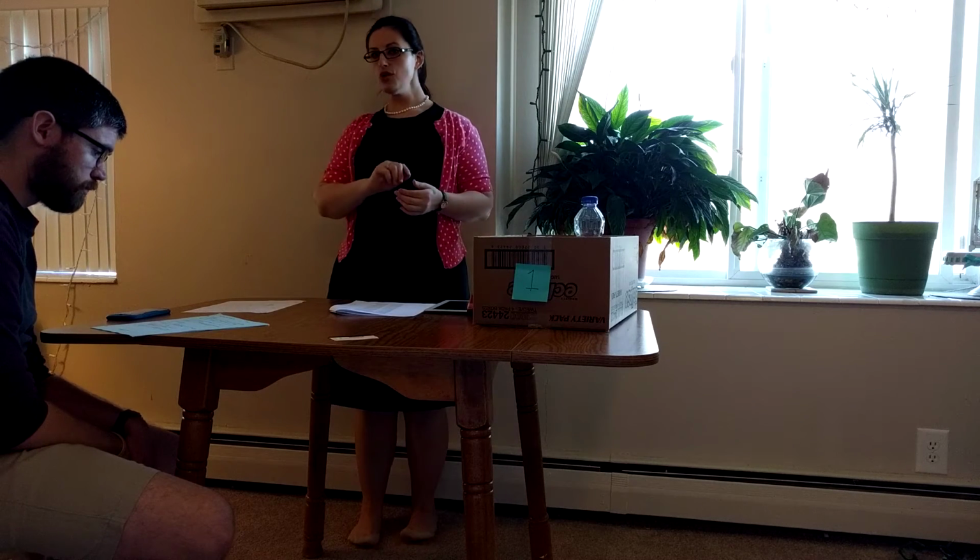So actually what we're going to do today is very similar to what I just showed you in our demonstration. You're going to do your own mixture activity, making your own mixtures, both a heterogeneous and a homogeneous, following the same type of method that I just did up here. So you're going to go to the back of the room where there are the labeled bins. See how mine's labeled? I was in group 1 per se. You're going to be in whatever group number it says at the top right corner of your paper. So what group number are you?